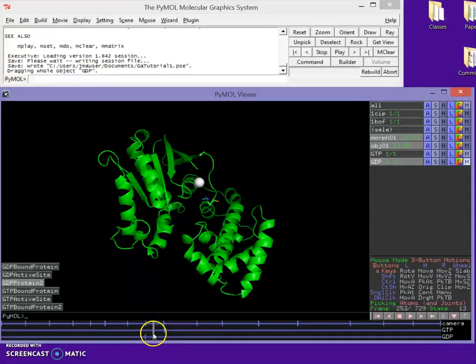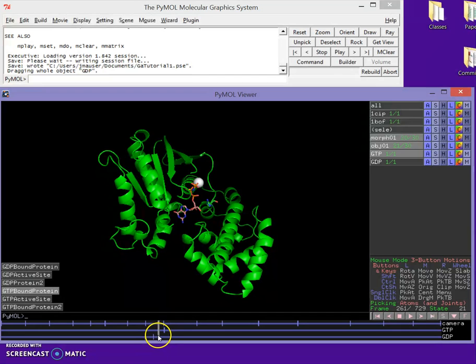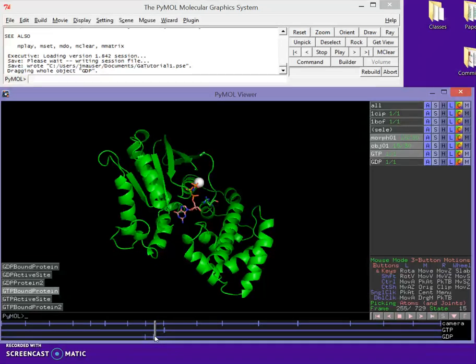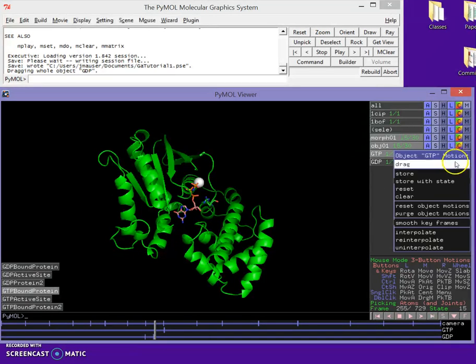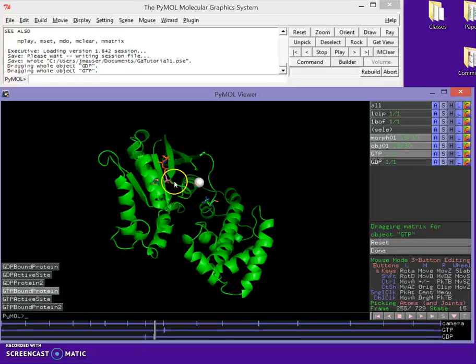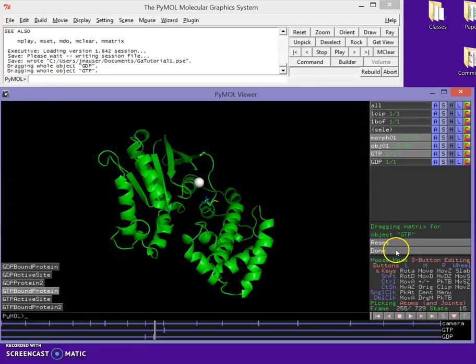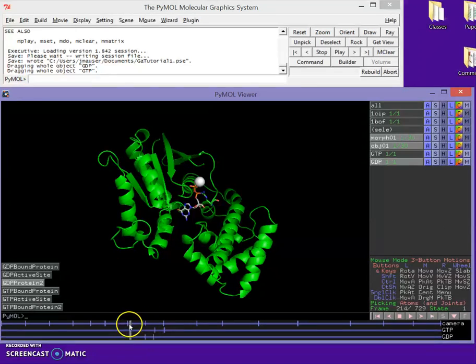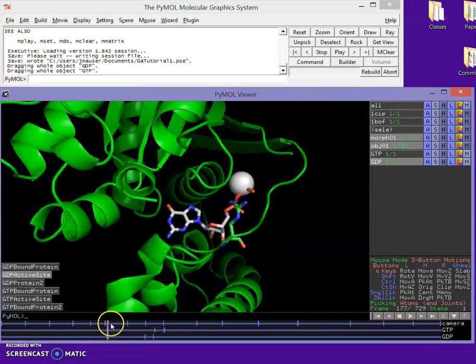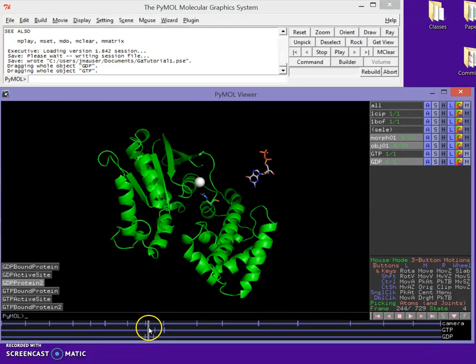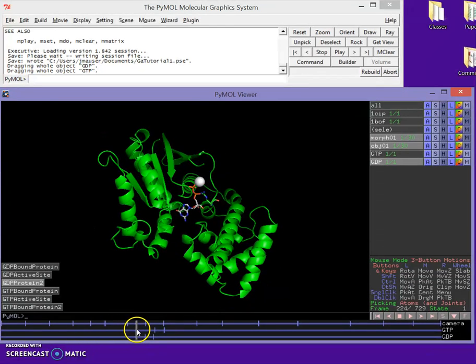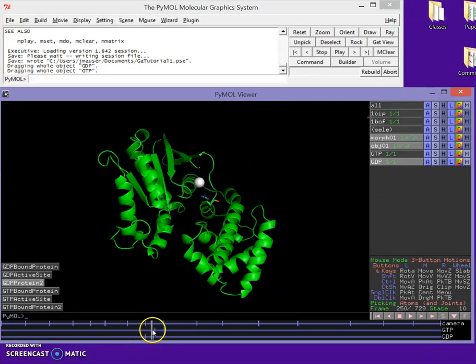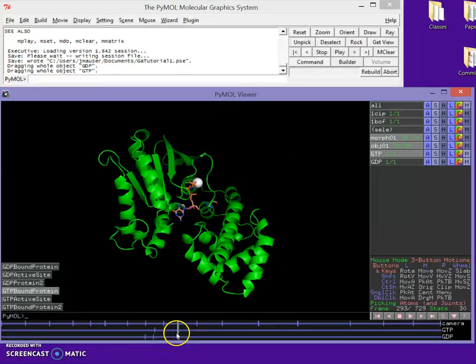Okay. Now I want to do the same thing for GTP. So you see GTP is showing up about here. And I want to, at this point, I want it to be flying in. So I'm going to do the same thing. GTP, I'm going to go to drag. I'm going to hold down my Shift key, right middle mouse button. And I'm going to fly it in from maybe over here. And I'm going to hit Done. So what we're going to see is our GDP is going to fly away. And our GDP is going to fly in.